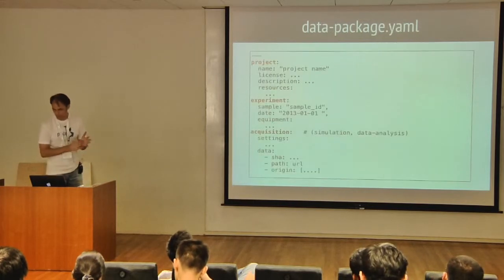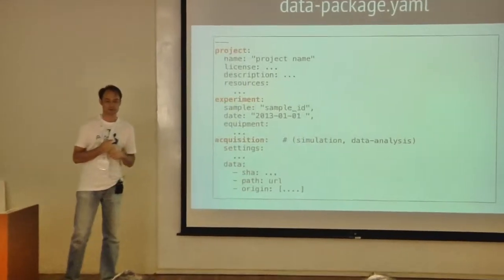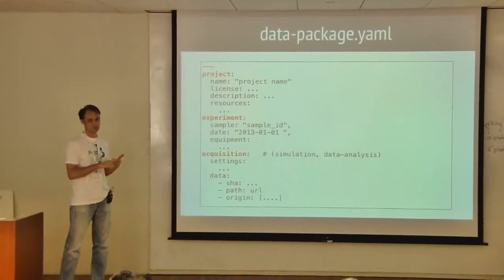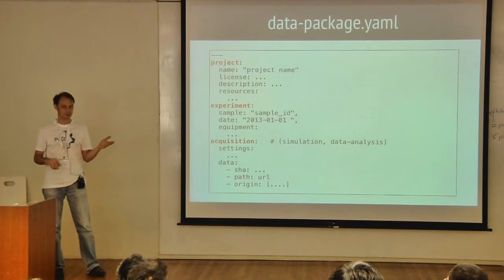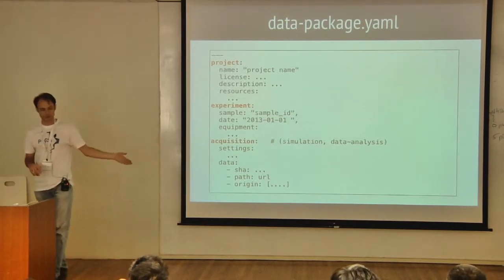Now I think YAML is even better for this, because it is much more human friendly, since there is so much variability in terms of the type of fields we want to cover and experimental conditions and whatnot. It has to be very, very free and fluid, in addition to having a few items of controlled vocabulary.